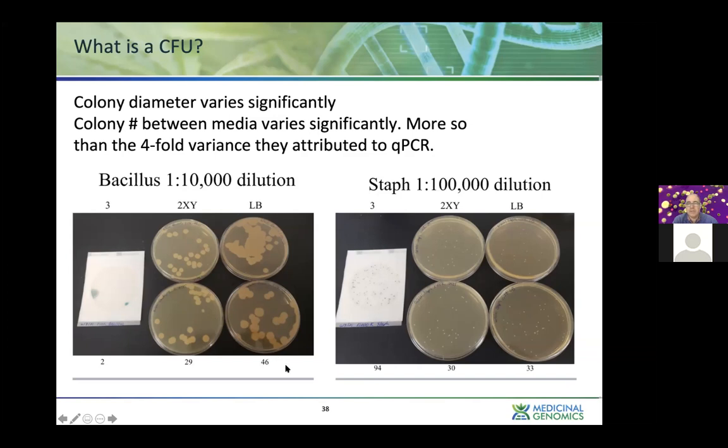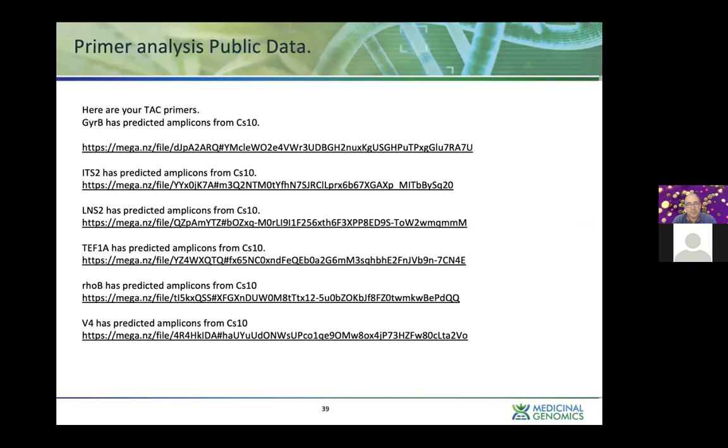So just the failure to have a really defined CFU puts the whole field into chaos, because depending on which one of these methods you use, no one ever agrees. All the labs point at one another, headlines end up in the news, and then all the consumers end up not having any confidence in the regulators. All right, we really got to dial in on what we're measuring here so that we don't create this public panic and that we all understand exactly what it is we're measuring.